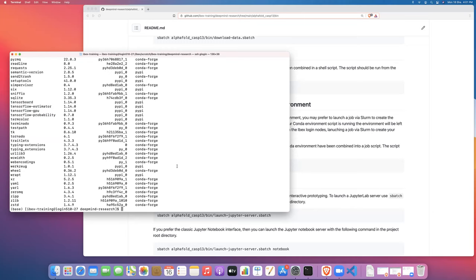And then once we're comfortable with that, once we understand the process of how that works, then in a follow-on video to that, I'll show you how to launch a training job on ibex, a batch job that will just run the whole pipeline for AlphaFold.